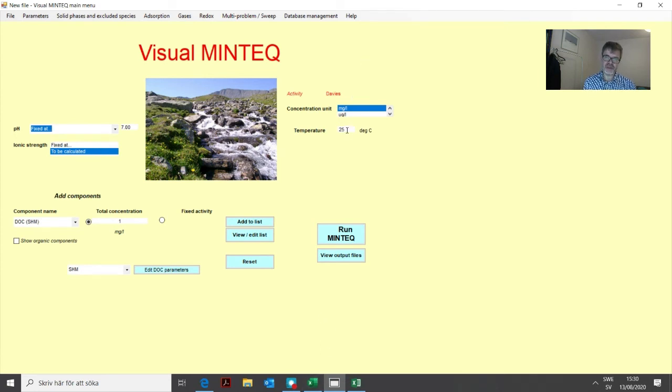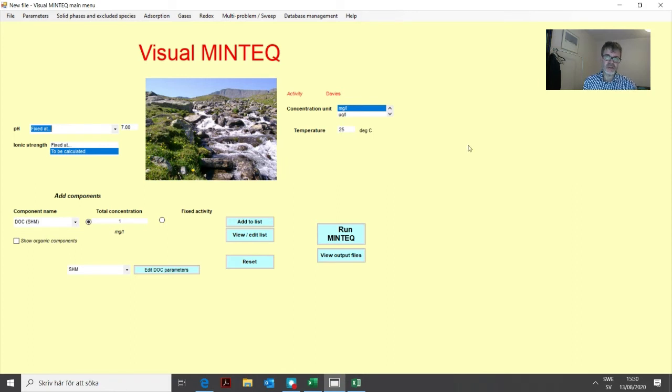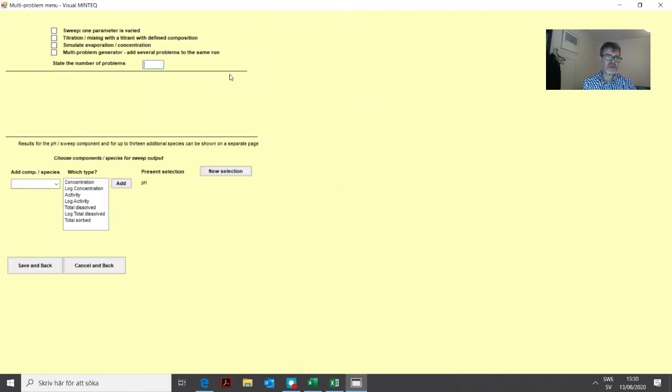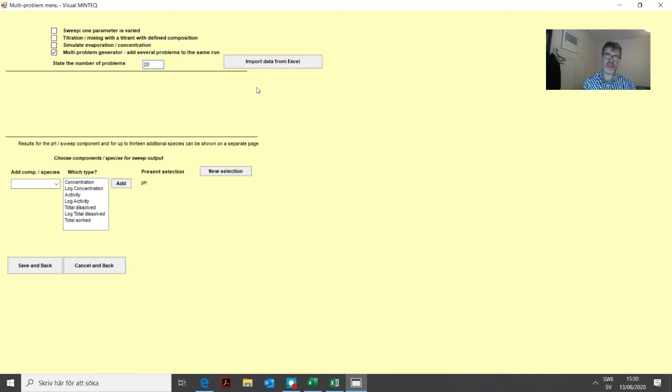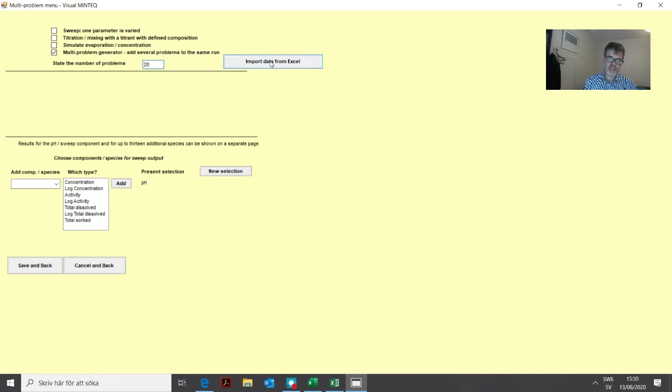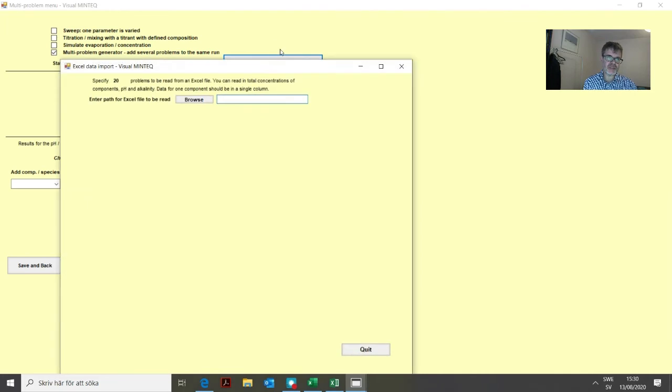The temperature will also be overwritten, we don't need to do anything about that now. We go to the multi-problem sweep menu, choose the multi-problem generator, add the number of data. We have 20 rows, 20 different lakes, so we add the figure 20. Then we have this button popping up, import data from Excel, so we click that.